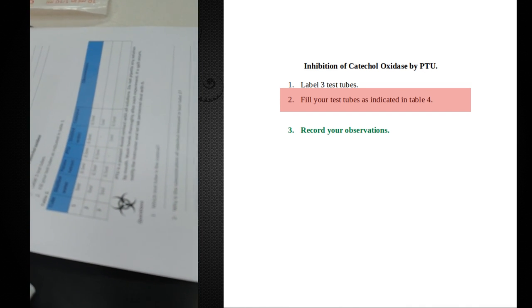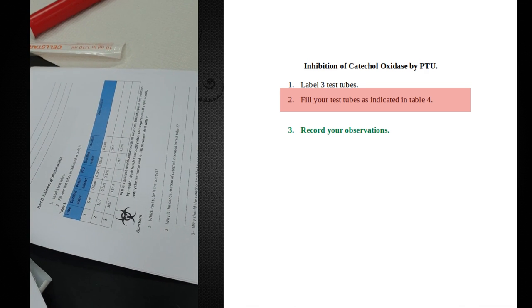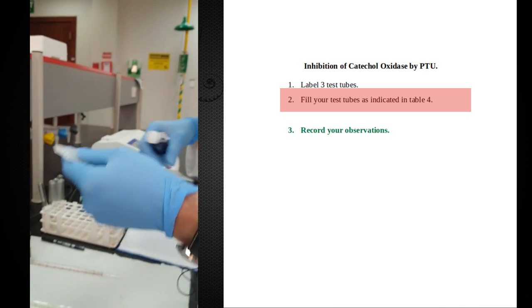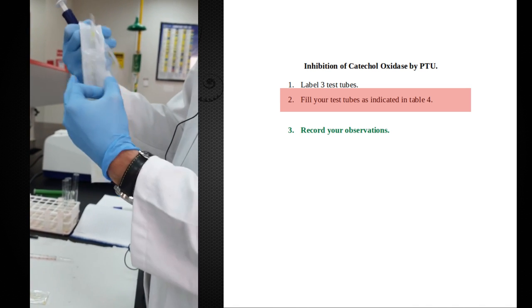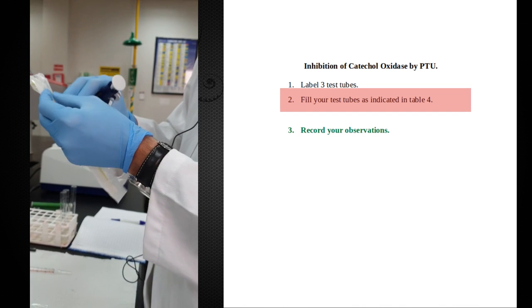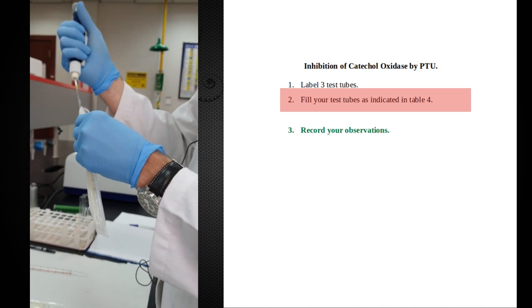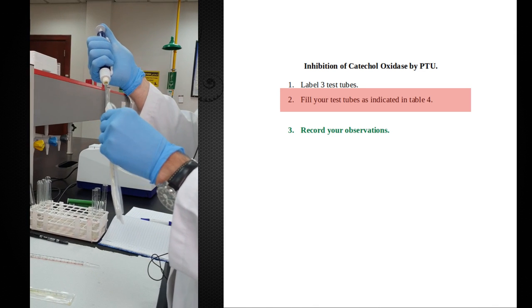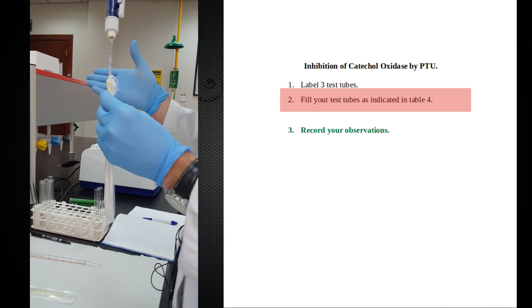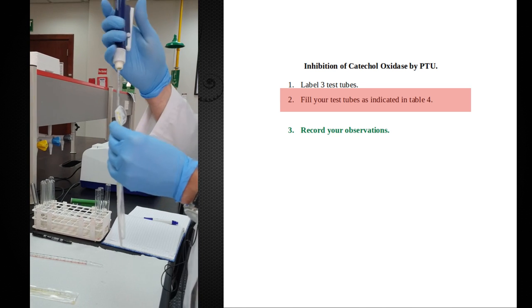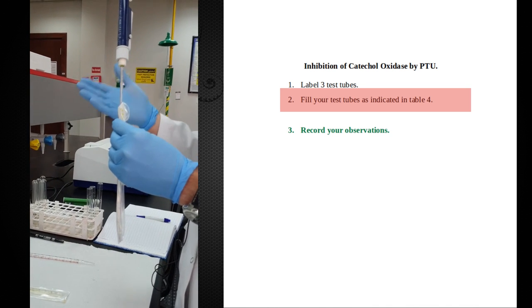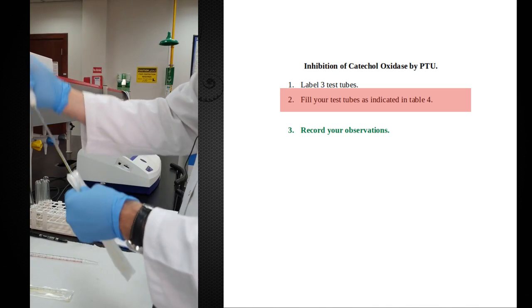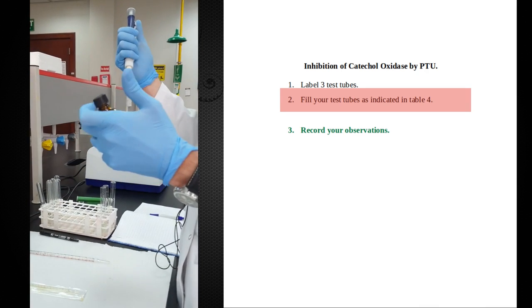Now tubes one and two will receive the inhibitor, the PTU. I'm going to add that next. The order here does matter. The moment you add the substrate and enzyme in the same tube, the reaction should start. So if you don't want the reaction to start right away, you don't want to add both of them together first. That's why the substrate will be the last component to be added. This way, the moment we add the substrate, that's when the reaction actually will start.